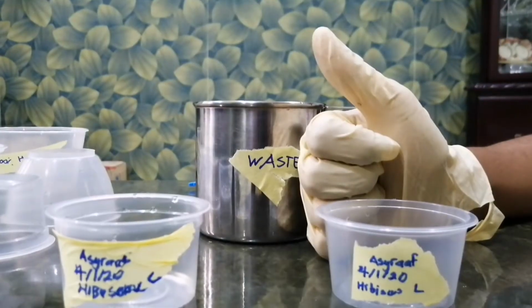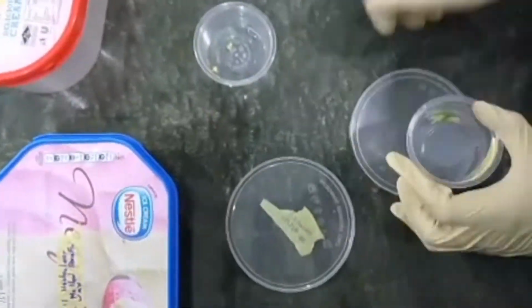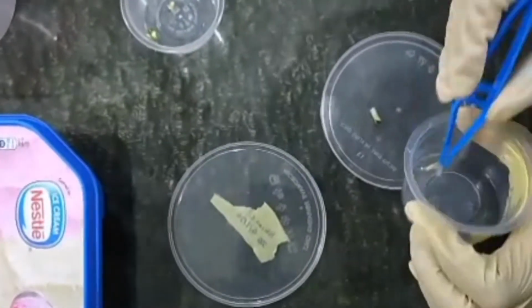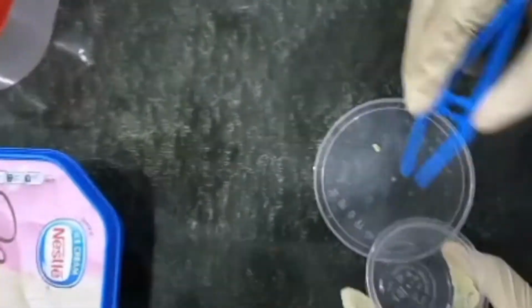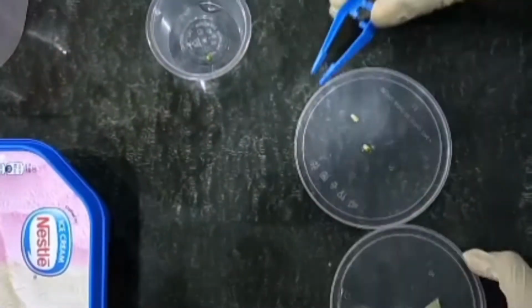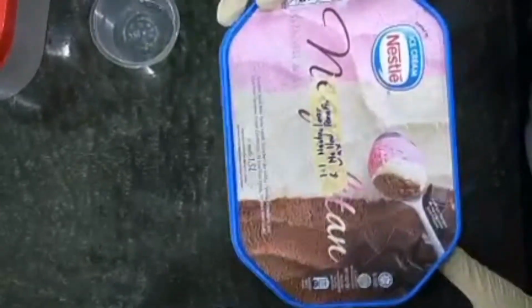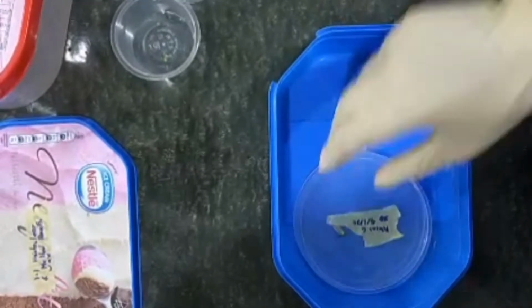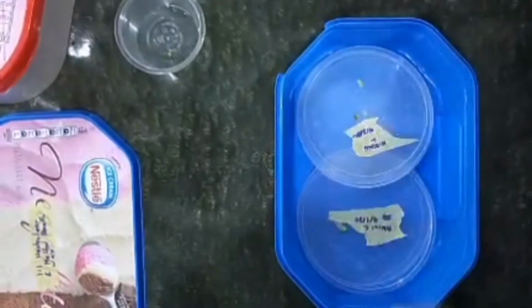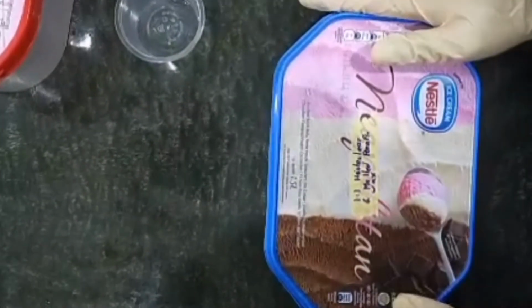Now we're done. Part 4. Infiltration and embedding. So the specimen is placed inside the label cassette and the lid is carefully clipped on. Next, the specimen is infiltrated in the 1:1 ratio of Histoclear and melted paraffin wax, and it is incubated overnight at 60 degrees Celsius.